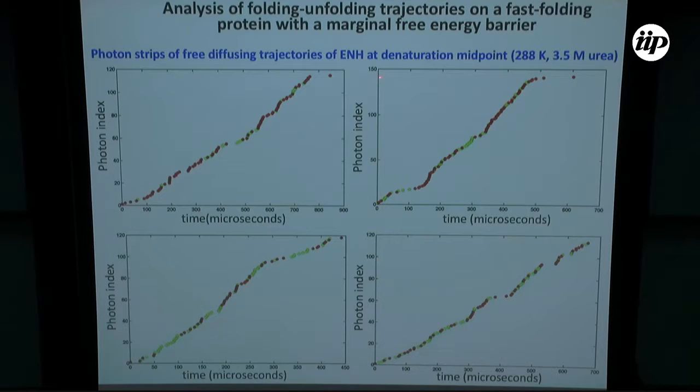For this molecule, we're getting something like 150 photons, and then it goes away. And all of those are similar. So that's the window that we have, all right? So we have a window that is about 120 photons on average, and typically corresponds to things between 300 microseconds to 900 microseconds. So we don't have the count rates that we had before, but it's still reasonable.